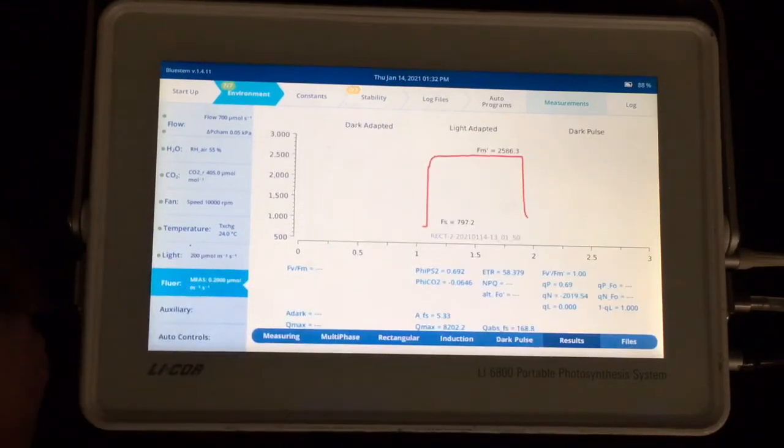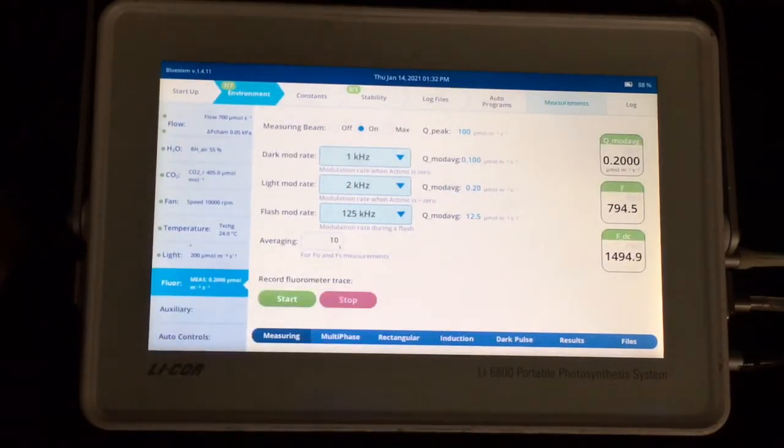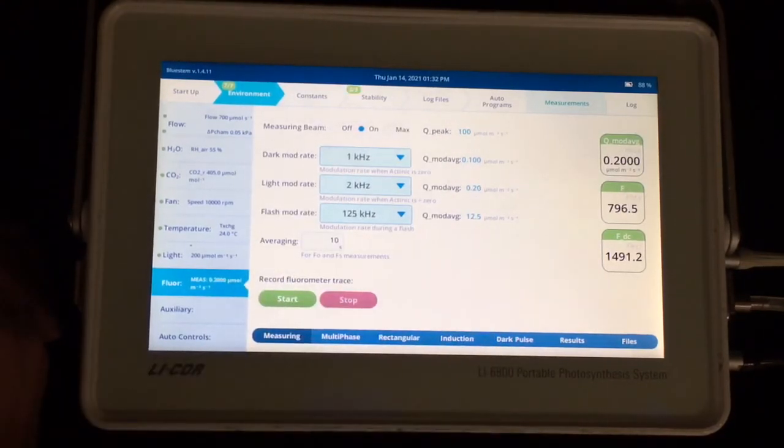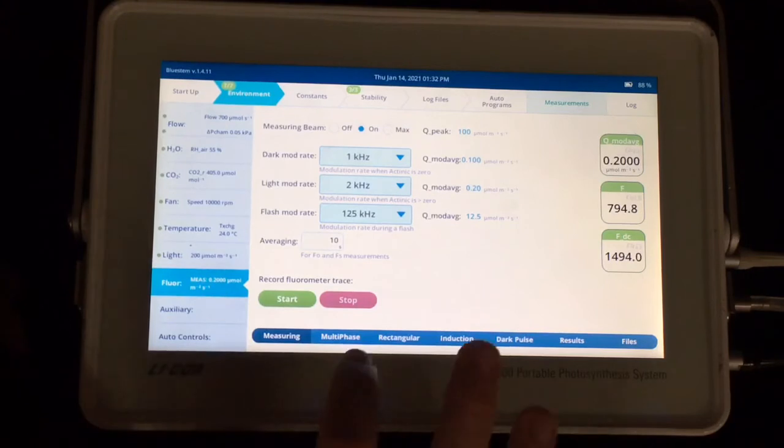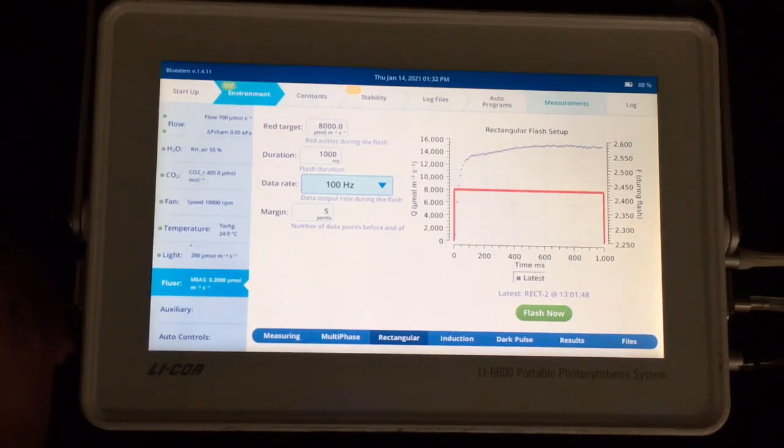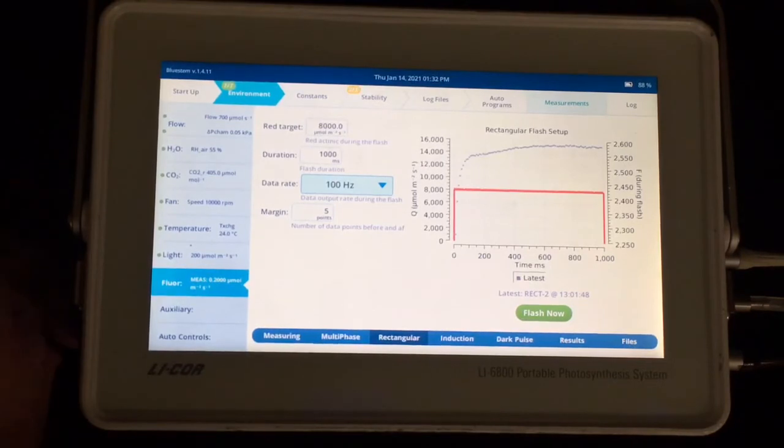If you also want to measure fluorescence, you would want to make sure your measuring beam is turned on. And the sort of standard modulation rates are a good starting point. And then you would want to set up the type of flash you wish to give. Here I'll give a rectangular flash. And a good starting point for making measurements is to look at maybe an 8,000 micromole per meter squared per second flash at about one second long. These are all parameters that would need to be explored to see their impacts on your plant material.